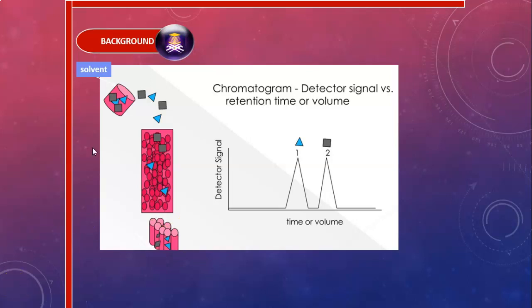Okay, this is the chromatogram of column chromatography. During the handling process of column chromatography, at first we introduce the solvent, which is the liquid, together with the substance that you want to separate. You must dissolve the substances into the solvent, and then pour into the column. Inside the solvent there is also the adsorbate, which is the sample.